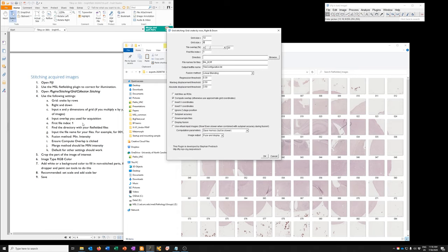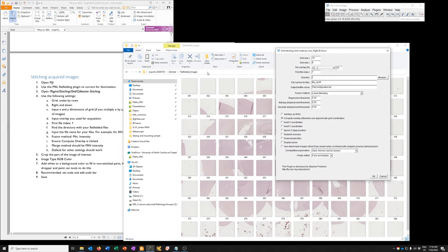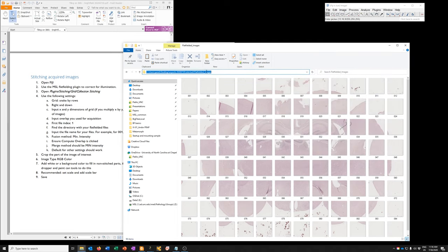If you look here, input the overlap you used for acquisition. That's 10%. I need to put it there. The first file index is 1. The directory with your tiles. So that's this directory. So stitched, flat-fielded images. Remember to use the directory with the flat-fielded tiles.